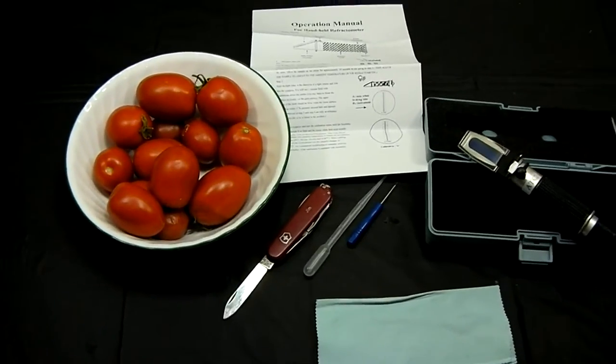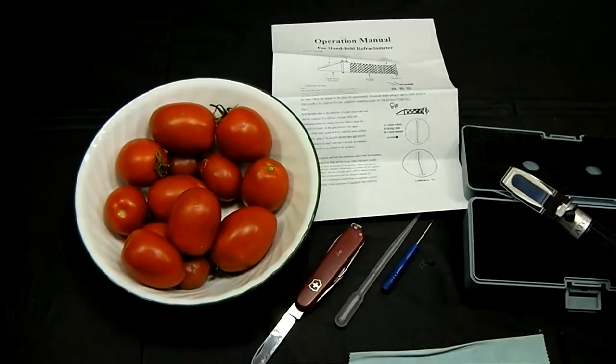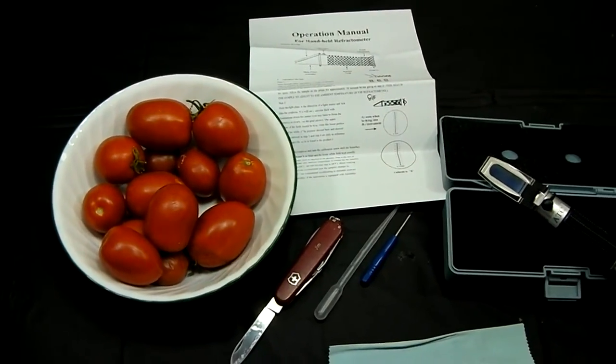Hey, Plain2Grow Jim. I'm going to show you a tool that you might not know about that can help you grow better vegetables and fruits.